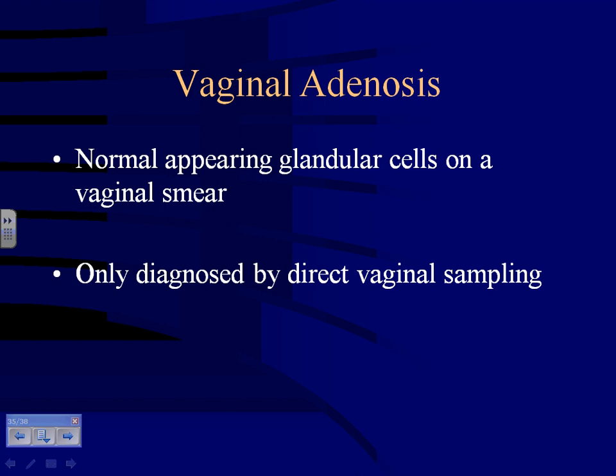Because we've gotten a number of times where it'll come down as a vaginal smear, and actually we see all these endocervical cells everywhere, and we say, well, gosh, you told us it was a vaginal smear, and we're seeing all these glandular cells that shouldn't be there. And so how do we know it's not just normal cervix versus the adenosis of the vagina if we're getting these mixed messages? We actually have a message, or a report, that we can use that addresses that.